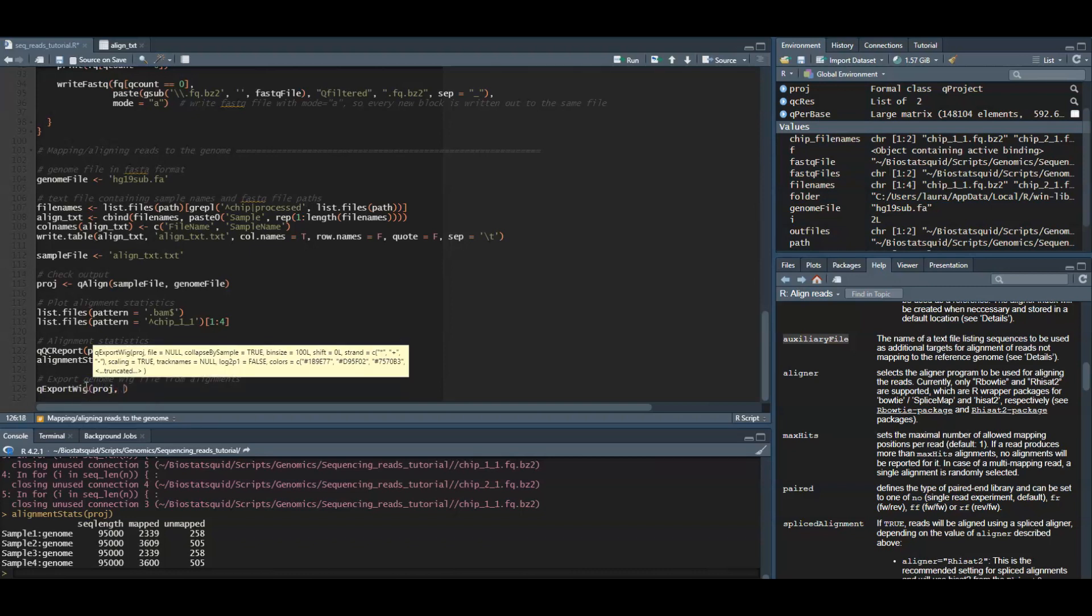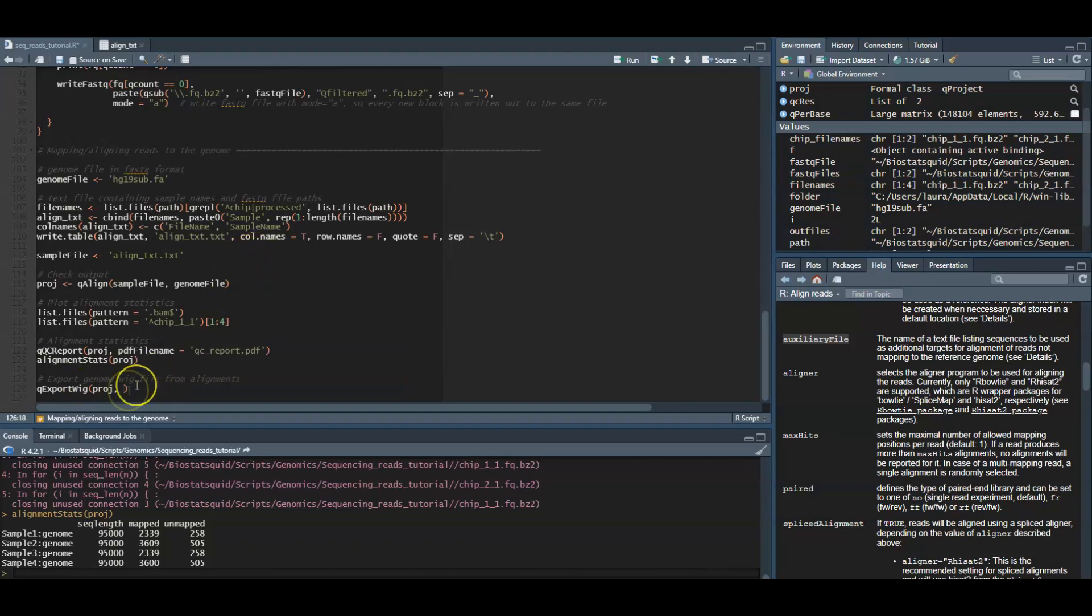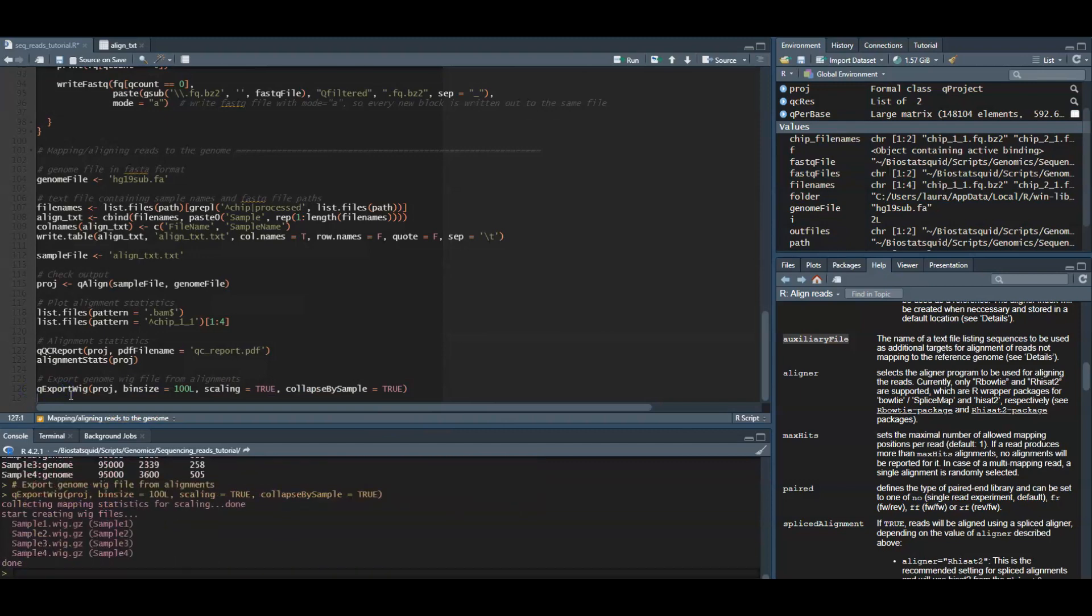And finally, if you want to visualize your alignments in a genome browser, the alignment coverage along the genome can be exported to a compressed WIG file using the qExportWig function.